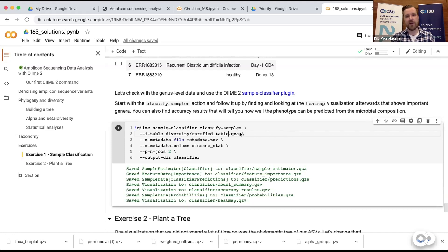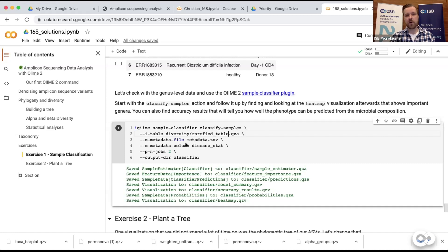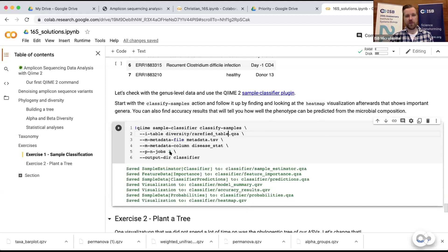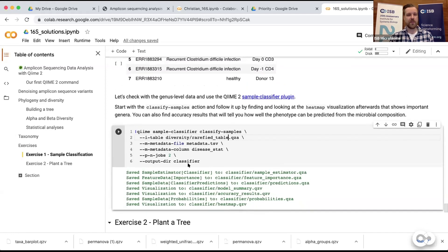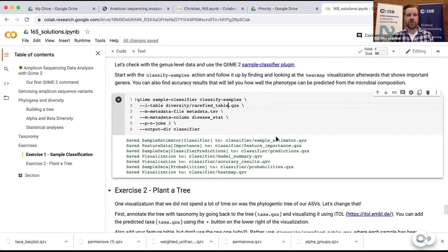In this case, if you did it with the rarefied table that's fine, you could also use the genus table. Then you would have put in the metadata file again, and that metadata file had the column disease status that told us who's healthy and who has a recurrent C. diff infection - that's what we wanted to predict. I also put an n_jobs parameter here of two - that's how many CPUs you want to use to run the analysis, it can make it a bit faster. In the Google Colab environment we have two CPUs.